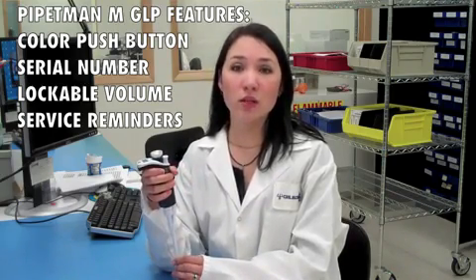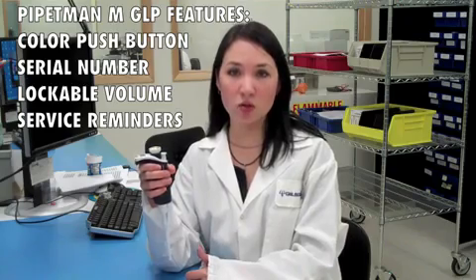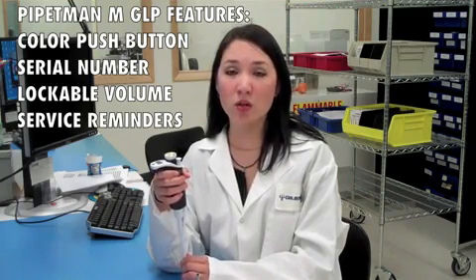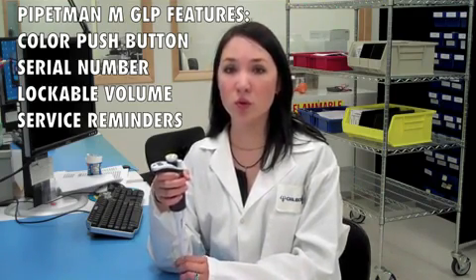Essentially, the only way to change the volume is by turning it the half-click to initiate volume change. Otherwise, the volume is always locked. And it also has the ability to set service reminders, so the pipette will actually notify you when it is due for service.